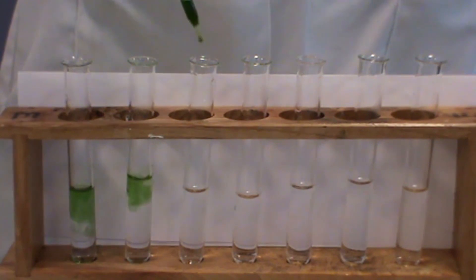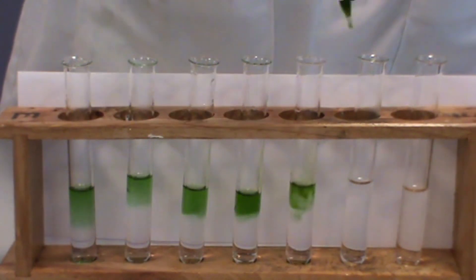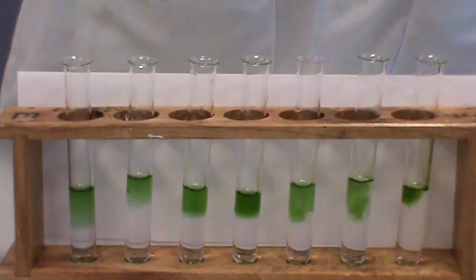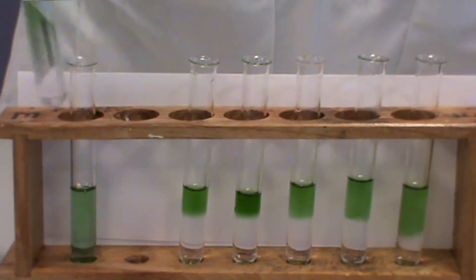Firstly, seven test tubes have been set up and part filled with water. Several drops of universal indicator solution are added to each test tube. The universal indicator remains green, indicating the presence of a neutral solution of pH 7. The test tubes are then shaken up, ready for the next stage.